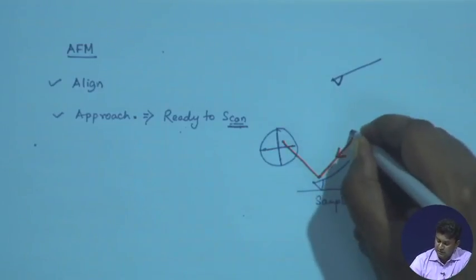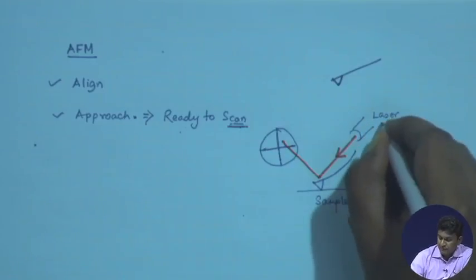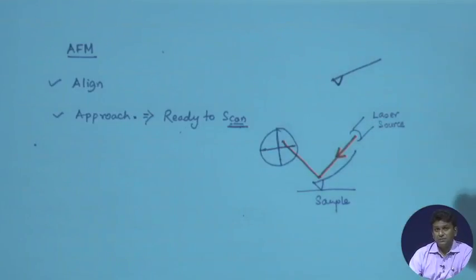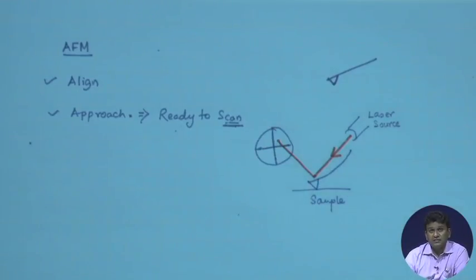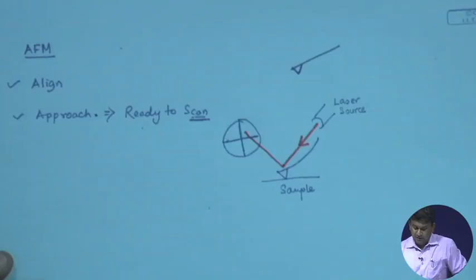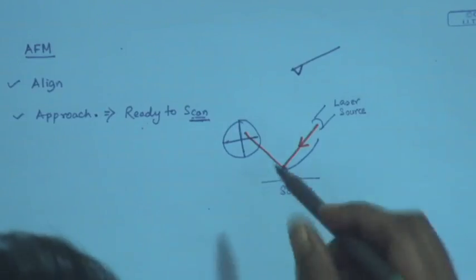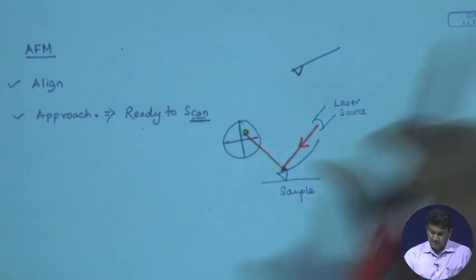Which would mean that in that case the laser source, the QPD and the tip move simultaneously. These three always remain coupled. There is deflection, therefore, the location where the reflected laser spot is falling can change. So, from this particular image, very simple looking image, of course, it is reflecting from the back side of the cantilever tip. Anything else you can comment? This is in fact the set point.